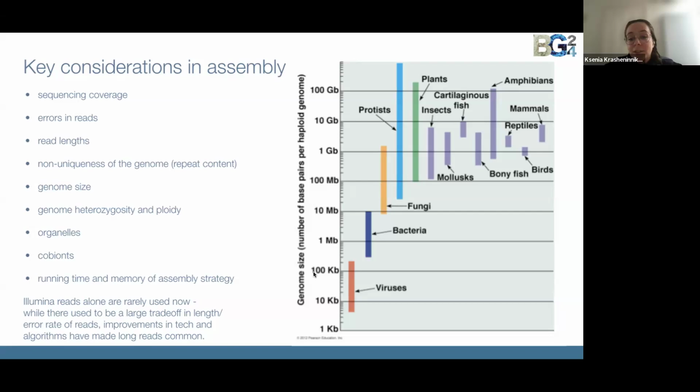Genome size is an important factor in the assembly. It can vary a lot in different phyla. The biggest genome we have dealt with in ToLA so far was the mistletoe that had a haploid size of 94 gigabases. The organelles are part of full genome assembly. There can be difficulties in assembling them because of the repeats and heteroplasmy. This is when multiple different copies of organelles are present in the genome. For mitochondria, reads coming from the historical nuclear inserts called NUMTs also add noise into the data. And depending on the used sequencing approach, organelles might not always sequence well.